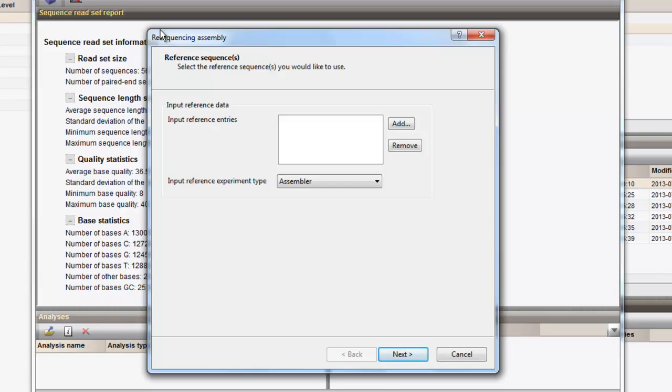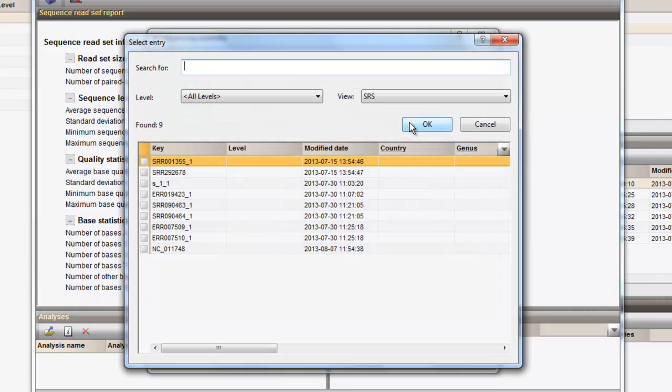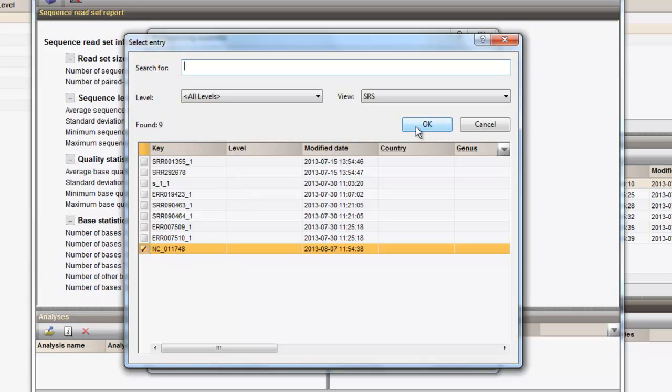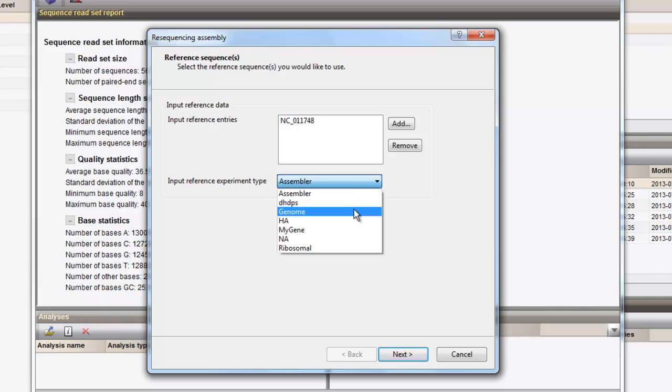First, we need to indicate the reference genome that will be used as mapping reference. We add the correct reference by selecting the sequence in the dialog. Once the entry is defined, we only need to confirm the reference experiment type where the reference sequence is stored, which in this case is genome, and proceed.